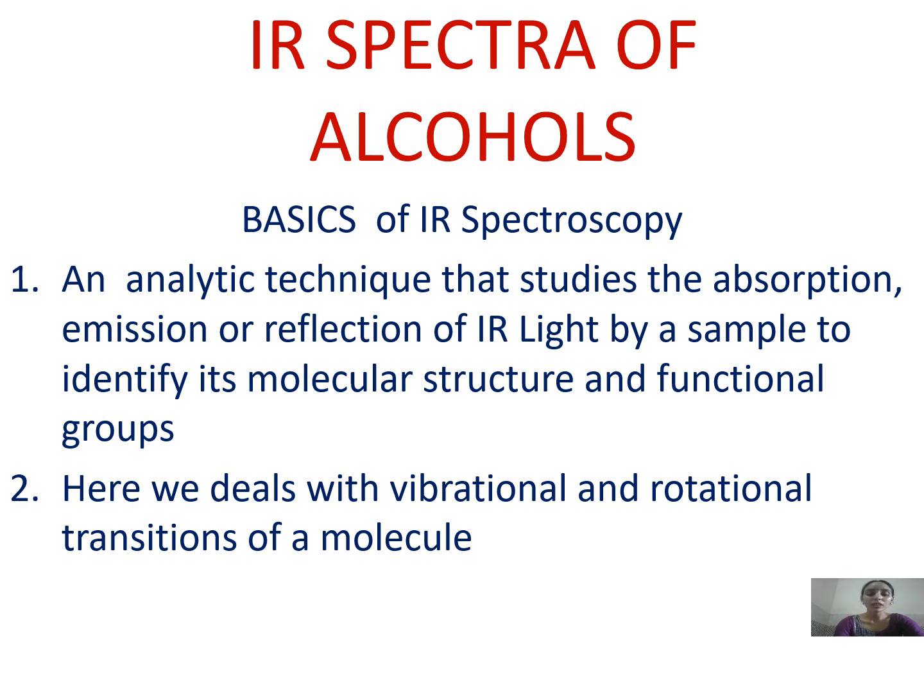IR spectroscopy is useful in finding the functional groups of a compound, and it is also used for purity analysis, reaction monitoring, quality control, and identification of unknown compounds.